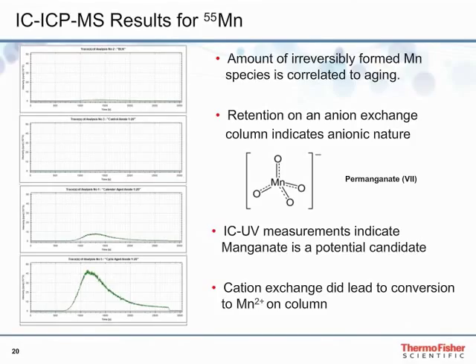Results for manganese indicate that the concentration found on the anode increases as the battery age increases. The manganese on the anode is originally from the cathode and has undergone an irreversible oxidation which causes a loss of cathode material and ages the battery cell.